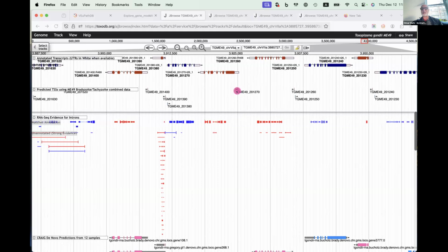thing we looked at is the transcription start sites. So this is a data set that specifically looks at the sequence of the 5' transcript start sites, right? Not translation start site, the transcript start site. So these typically include the beginning of where transcription starts, where the UTR starts, the untranslated 5' region.